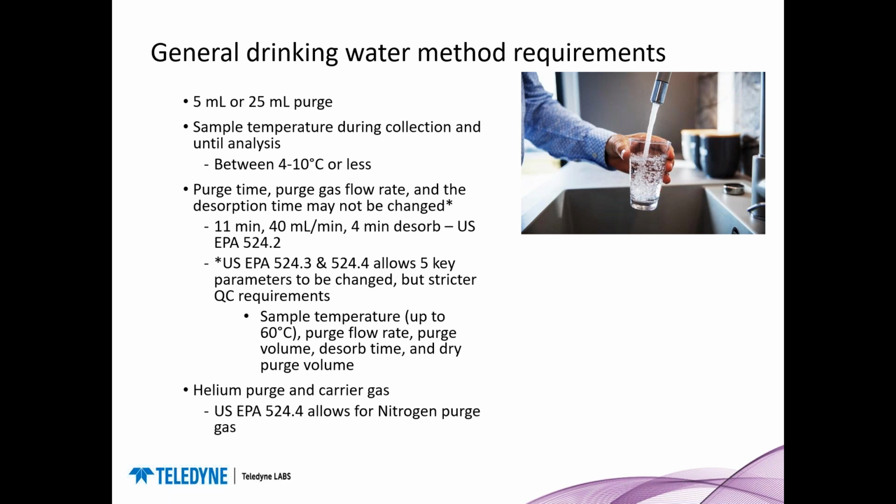So most drinking water methods specifically call out helium as a purge gas. And then, like I mentioned, 524.4 allows for nitrogen as the purge gas, saving on that expensive and increasingly hard to source helium.